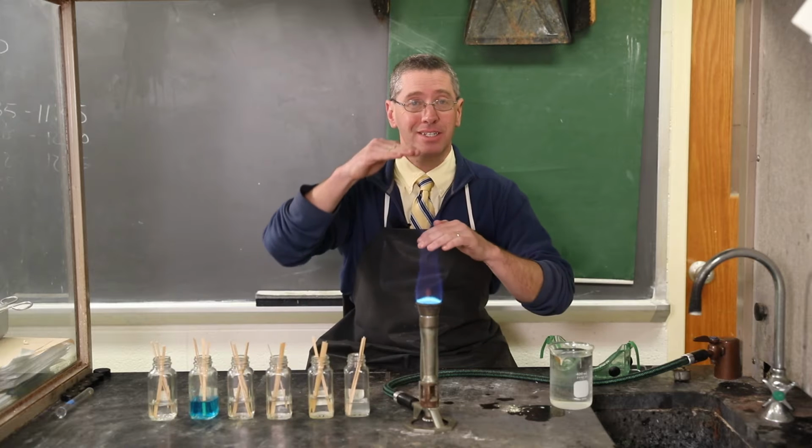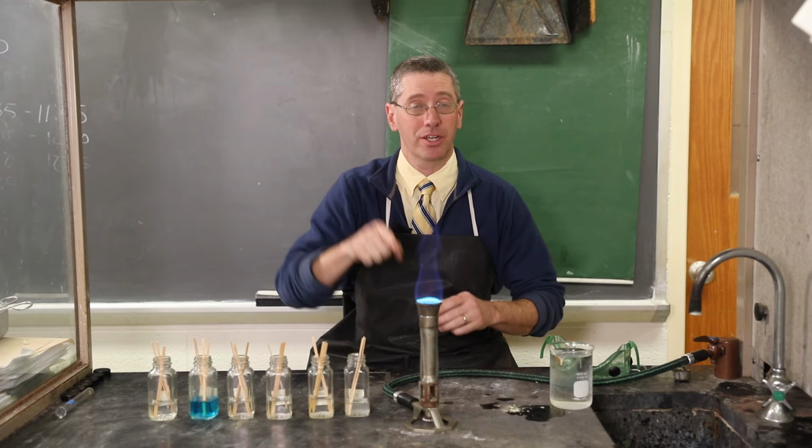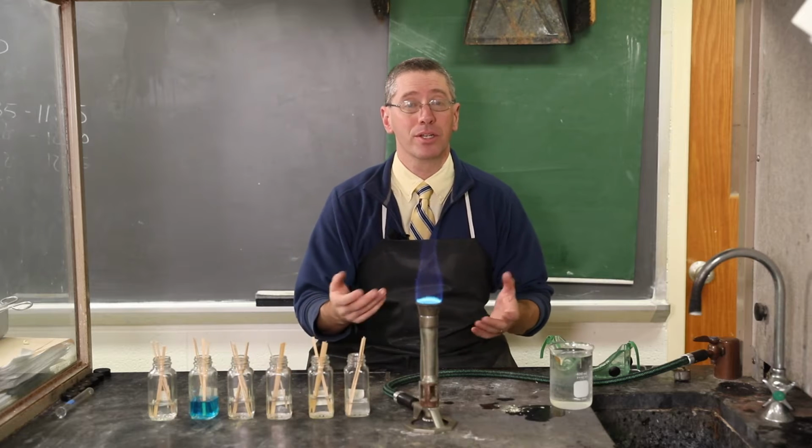And because the distance is different between each element's ground state and excited state, as those electrons fall down, they give off different colors of light for each element. And I have a selection of 6 elements here that we can burn and see their colors.